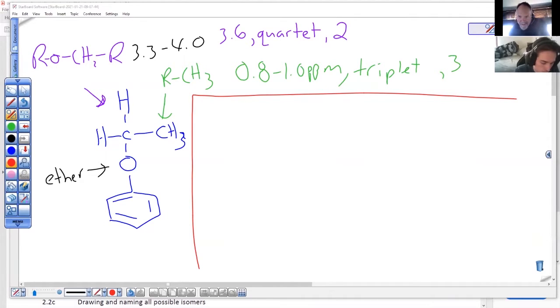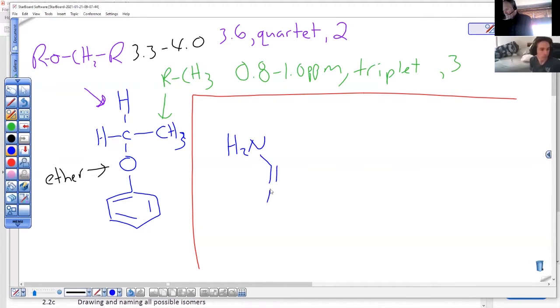Creatine. If it has a charge, that'll mess us up. No, it is guanidino. I'll just copy down what I found on the internet. H2N, and H and methyl, and an acetic acid on this end.